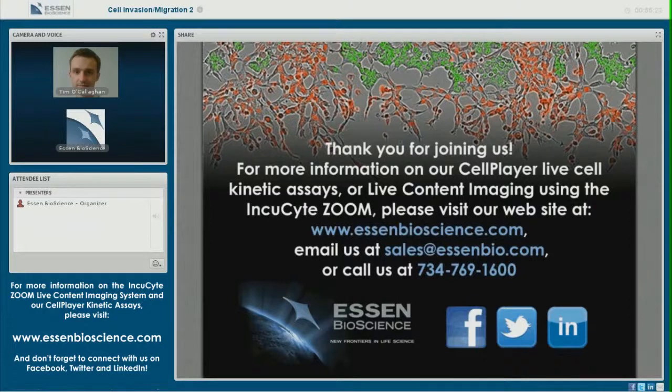So that's another way to take into account proliferation over the time course. These are techniques that can be performed and are suitable and compatible with this technology. So that's not a problem at all. You can either serum starve or run with full serum as you wish.